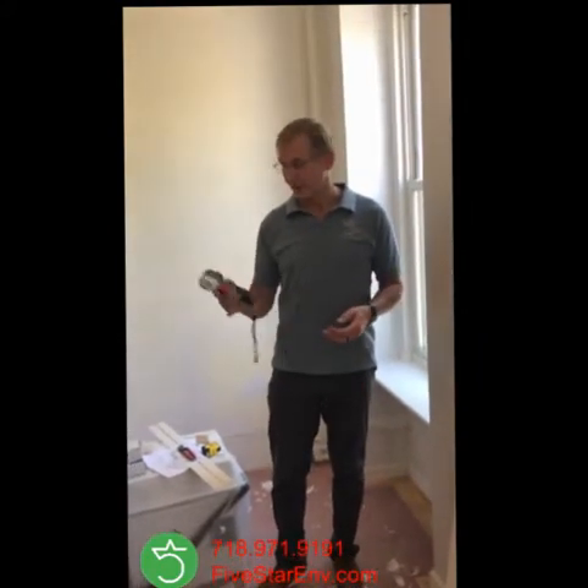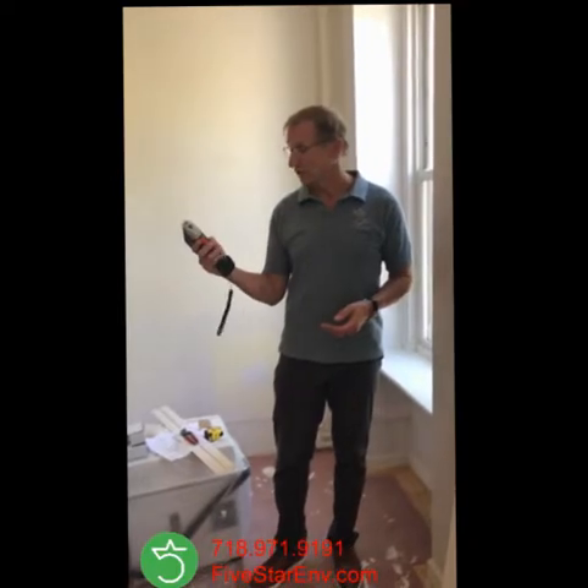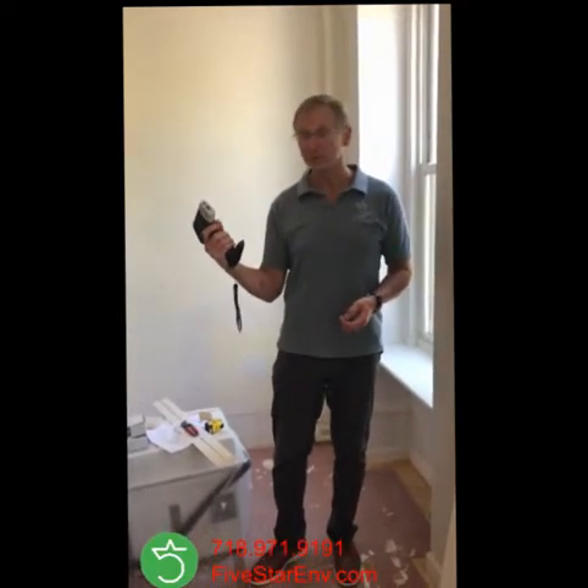Hi, this is Peter, the environmental inspector. Today I want to show you a lead inspection with the XRF radioactive instrument, which can detect lead on the spot.